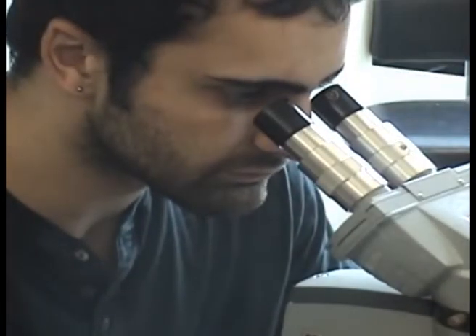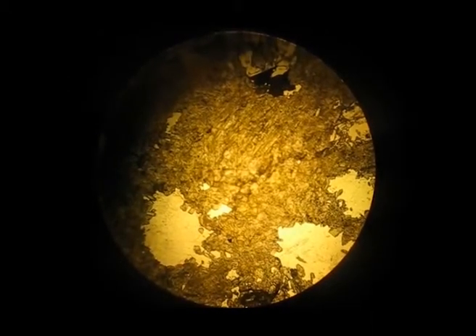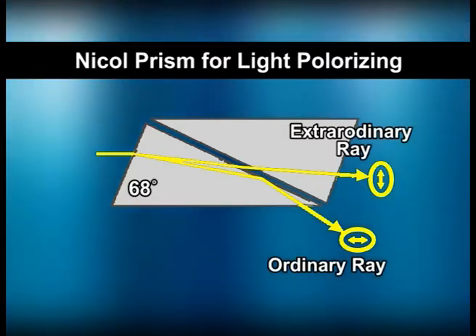A petrological microscope is a type of microscope used in the study of thin sections of minerals and rocks. It differs essentially from an ordinary biological microscope in having a revolving and graduated stage and two Nicol prisms, one below the stage and the other above it. Nicol prisms serve the purpose of converting ordinary light into polarized light suitable for the determination of optical properties of minerals. A petrological microscope is therefore called a polarizing microscope. There are several makes of petrological microscopes.